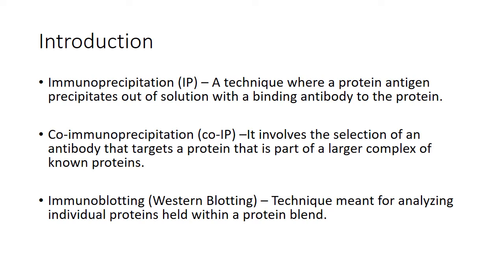The proteins then adhere to the membrane in that pattern of separation, due to the interaction of charges. The proteins on the immunoblot then become accessible to antibody binding for detection. The antibodies carry, for instance, radioactive labels or an enzyme. This leads to color recognition or emission of light, which enables the detection of these proteins.